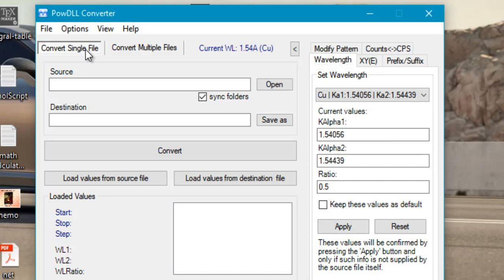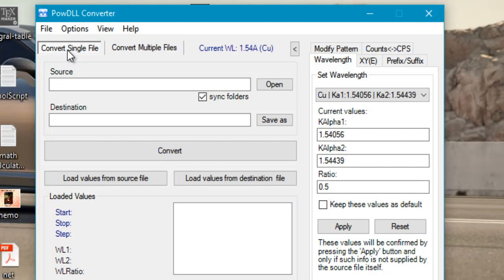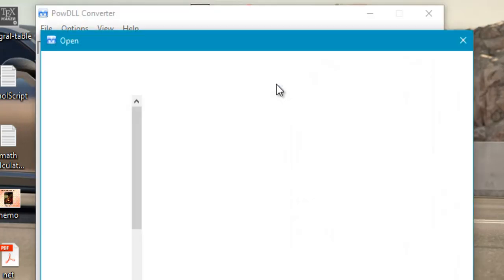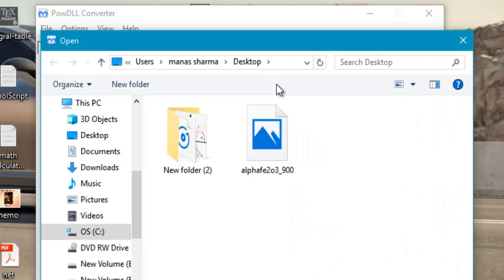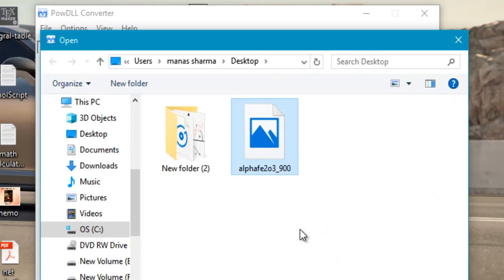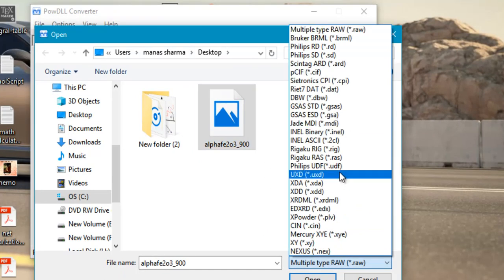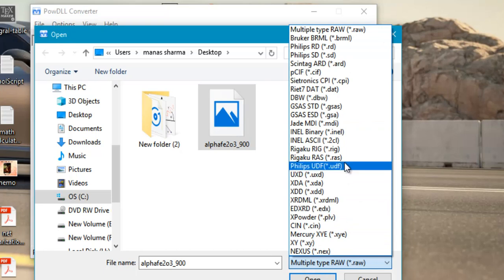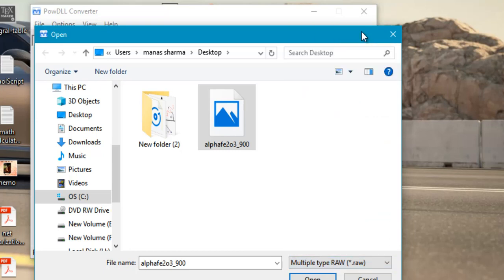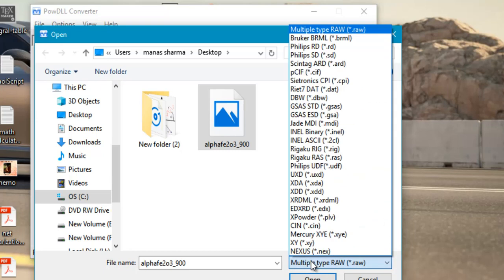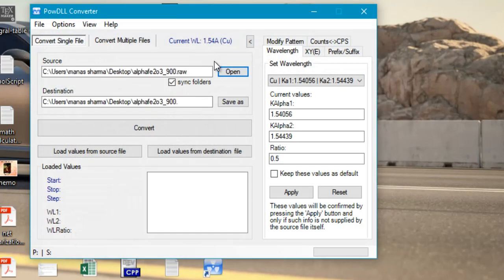Here you can select either of the tabs such as convert single file or convert multiple files. However we will just convert a single file. Just select this tab and go to open to open the raw file. Here on my desktop I have a .raw file of the XRD pattern of alpha Fe2O3. In the file types you can select a bunch of other data types produced by various diffractometers in the industry. There are a lot of popular data types here. However I have the .raw file so I will be using that. Just go ahead and select this and click on open. That would define the source file.